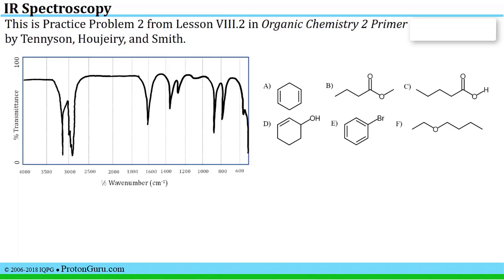Let's take a look at our first spectrum. This is practice problem number two from lesson 8.2 in the primer. When I look at this spectrum, I can initially check to see whether I think there is an aromatic species. That's what the decision tree in the primer suggests you look for. What you should see would be some sort of CH stretch corresponding to a CH on an SP2 hybridized carbon. We see something in that general region. We should also see some overtones in this region, really small peaks. And we don't see anything like that. This area is completely smooth. So that might rule out the aromatic right there.